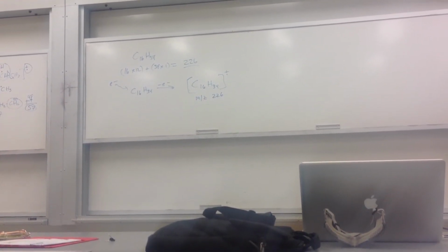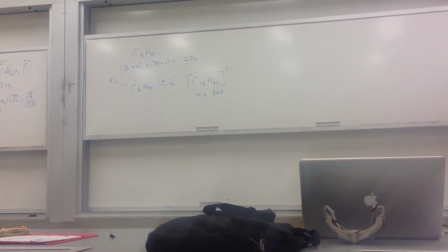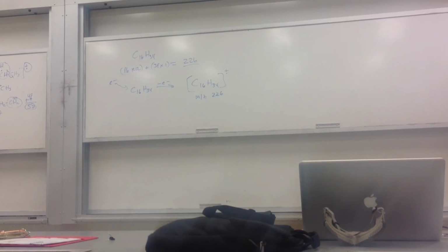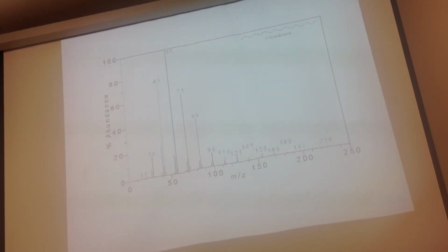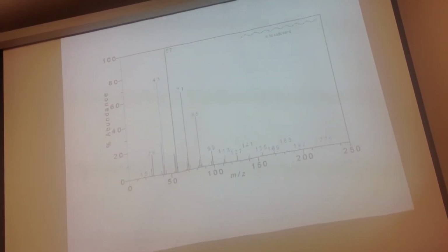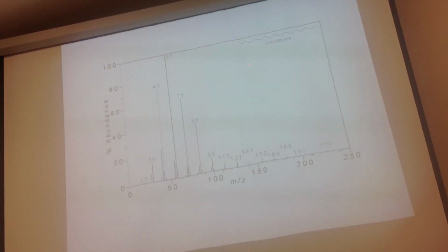And do you see it in there? Yeah, it's right there, it's the highest mass. So whenever I got a mass spec back, I would know what my molecular weight should be of what I thought I made. I would zoom right over to the highest mass and check it out. That's what everyone does. So, there's my molecular ion peak, right there. It is tiny, right? What does that tell you? The fact that it's tiny. Yeah, most of this molecule blew apart into pieces. So what we should see, if everything is true, is we should see minus a CH3, and then minus CH2, minus CH2, minus CH2, minus CH2, and on and on and on we go.